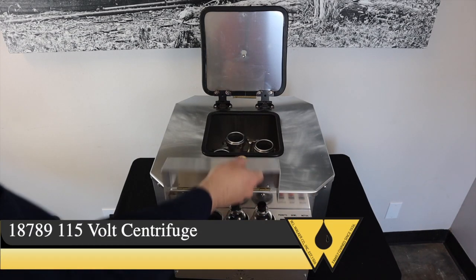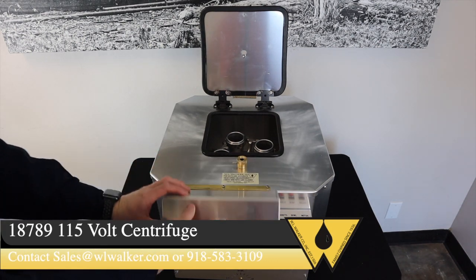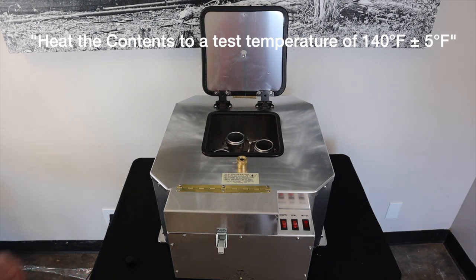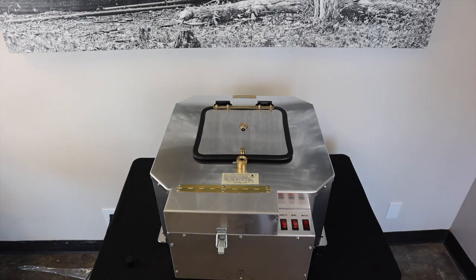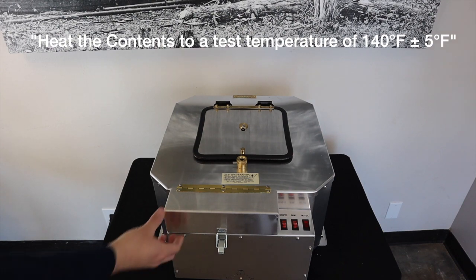Once a representative tank sample has been obtained, the sample should be placed in a preheater and heated to ensure compliance with API Chapter 10.4. Be sure to allow ample time for the samples to reach the mandated temperature, then return to the unit and check the temperature of the samples.